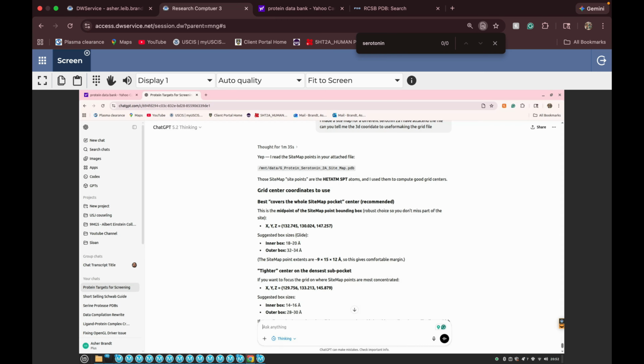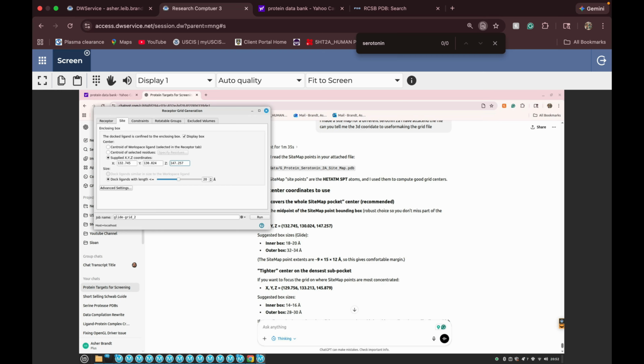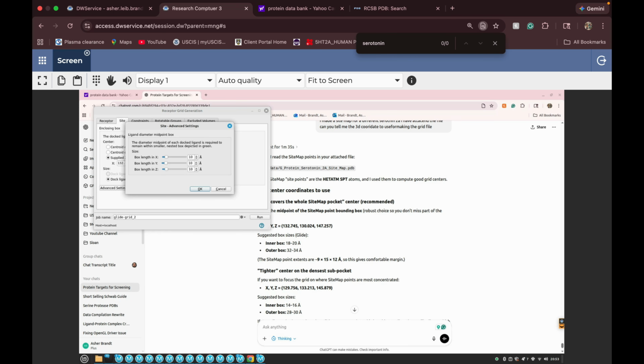We'll just compare the numbers again. Just want to be sure I put them in right. 132.745, 130.024, 147.257. Excellent. I'm going to go back here. I'm going to go to advanced settings. Okay, it says to make the inner box 18 to 20. That's kind of big. Yeah, 14 to 16 is more appropriate, I think. I don't listen to ChatGPT for everything, but for some things it's really good. Like that, I wouldn't have been able to figure that out faster than Chat did.